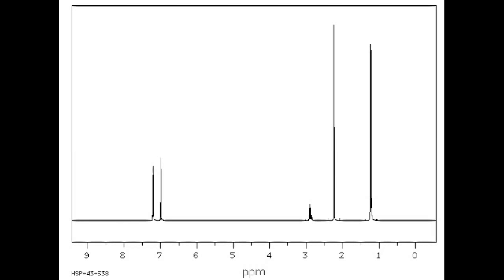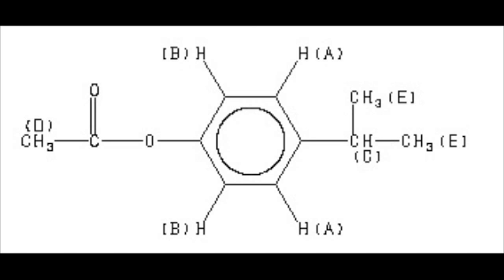Because I want to prove the point that you can't really tell how many peaks there are on certain multiplets. You're just going to have to wing it and say, okay, I know there are a lot of hydrogens next to whatever hydrogens are producing that signal. But what I do want to point out is, look how low down that multiplet is. Compared to the peak right next to it, I'd say it's 10 times or so shorter. Well, the shorter it is, the more hydrogens it is next to. And you'll get an idea of how to ballpark that as you go on.